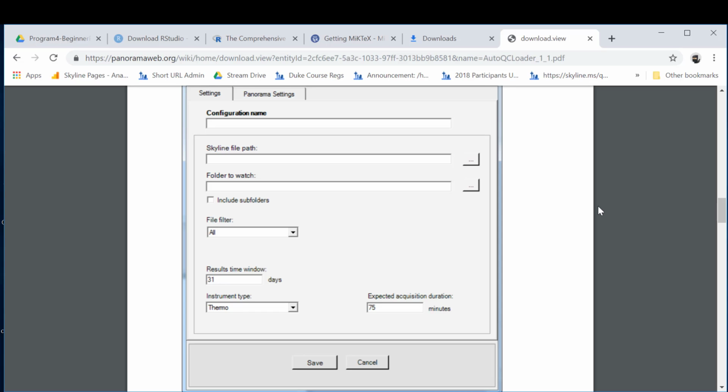If I have several instruments, can I have several profiles checked in parallel? Well, do you have one computer for several instruments? No, but I have several instruments mapped on my computer. My LCMS system is somewhere else, but I have the data folder where the QC is coming in mapped on my computer, and this is where the AutoQC also is. Then I guess that's where it would have to be. I guess in my lab, maybe it's set up weird.